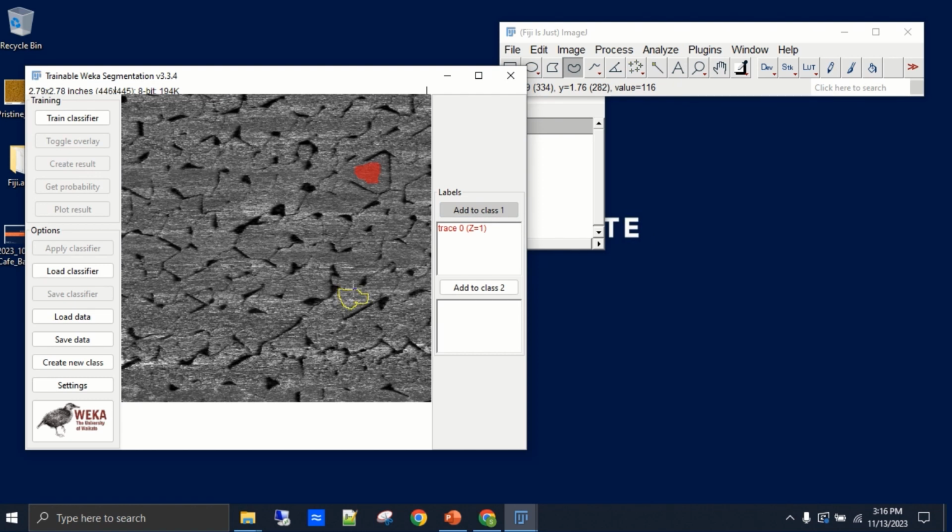So you see here, there's a little white streak that goes across this image. Possibly something might have changed in the feedback of the AFM as it was scanning, but you want to make sure you capture these different types of backgrounds, and then it will do a better job in segmenting this out. So I might want to collect one near the edge here.